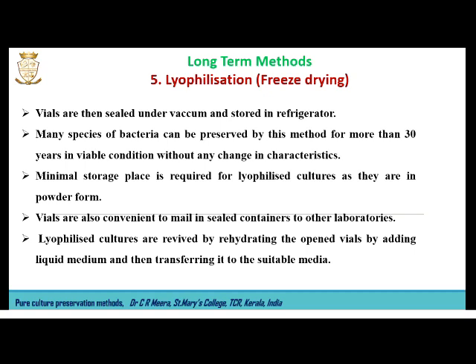Also, it is very convenient to mail these vials in sealed containers to other laboratories. The lyophilized cultures have to be revived before using. First, we have to rehydrate the lyophilized vials by adding liquid medium into it, and then it has to be transferred into the suitable media and incubated.